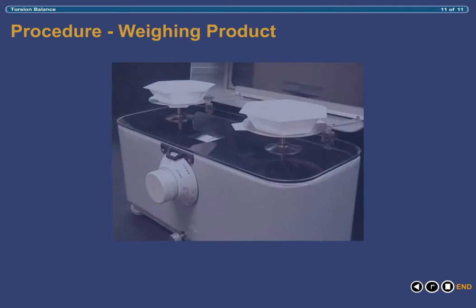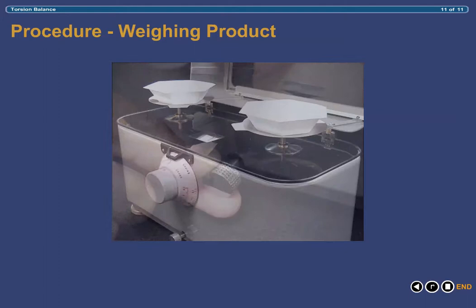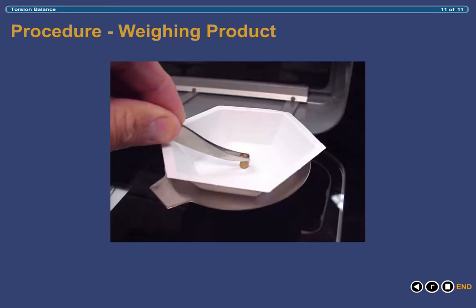The first step in weighing is to place either weighing boats or weighing paper onto each pan, then close the lid. Release the locking arm and double-check to make sure that the balance is still level. Oftentimes you will encounter small weight variations among weighing boats, which will require small adjustments of the leveling screws to return the balance to a level state. Once you have ensured that the balance is still level, lock the pans into place by rotating the locking arm clockwise. The next step is to add the desired weight from the weight set to the right-hand pan. In this illustration, the desired weight is 1.5 grams, so using the tongs, we place the 1 gram weight into the weighing boat on the right-hand pan.